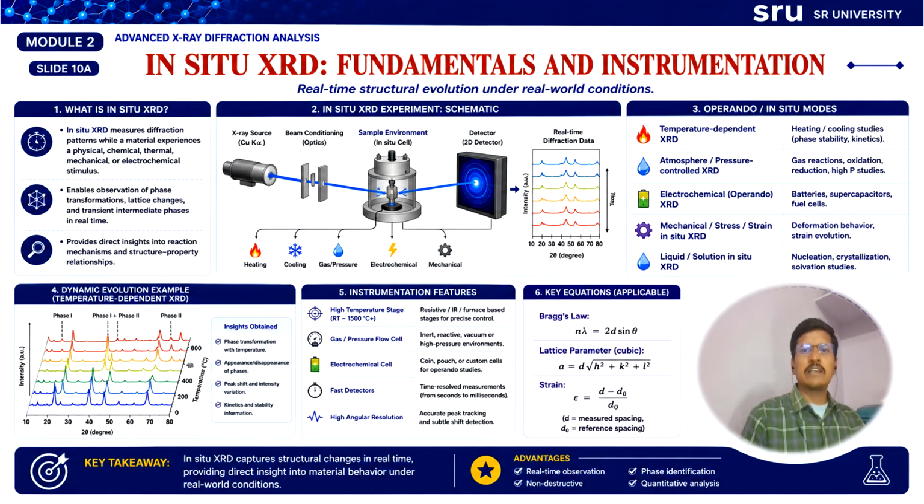The conventional XRD provides the structural information before and after the experiment. However, many materials undergo continuous structural changes during heating, cooling, electrochemical reactions, gas exposure, or mechanical loading.